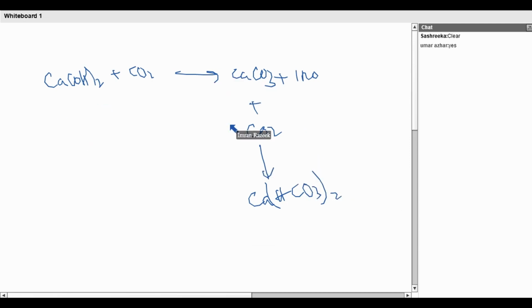And especially if you are heating the solid, you have to also be careful of the suck back, because when you take the boiling tube away from the flame, there will be a vacuum created, and then the lime water gets sucked into the hot solid. In that case, the boiling tube will crack because of a cold solution being added to the hot solid.